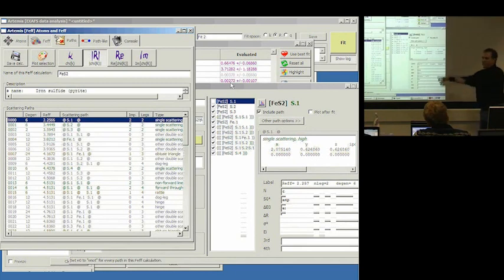This is finally starting to peek into the whole point of Artemis and EXAFS. This ability to write interesting little math expressions to evaluate the parameters of the EXAFS equation in terms of the parameters of the fit is what lets us do really great things in the data analysis program.